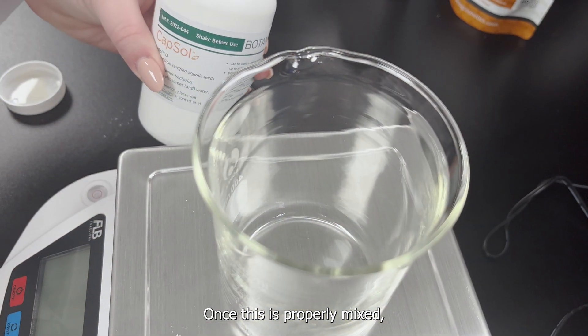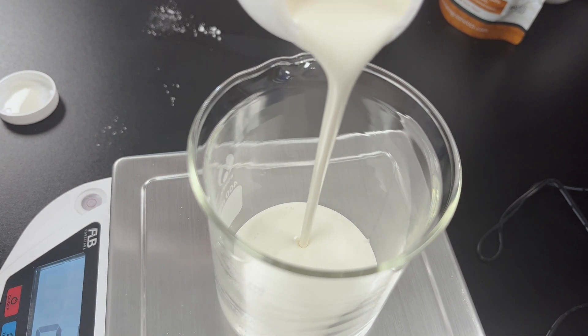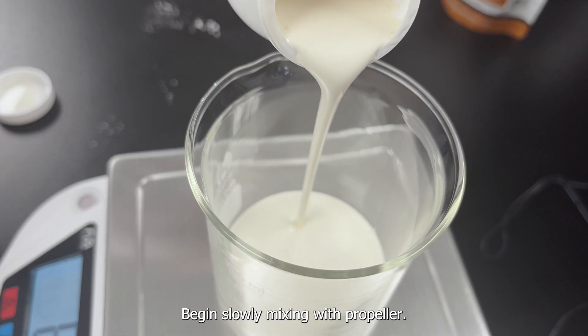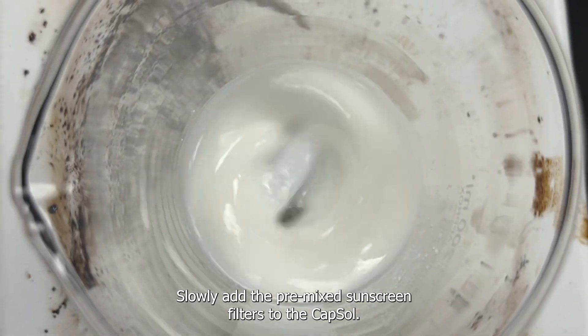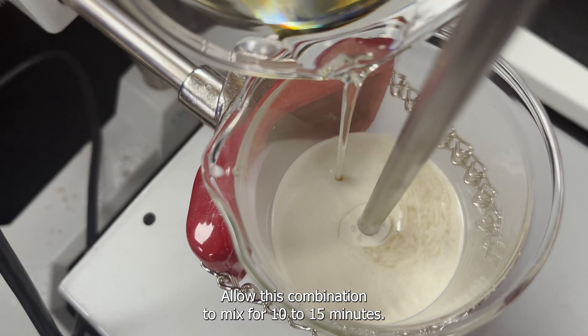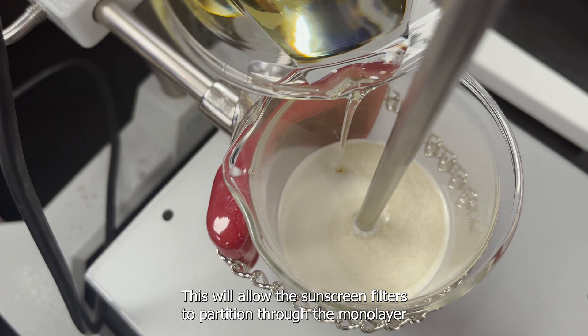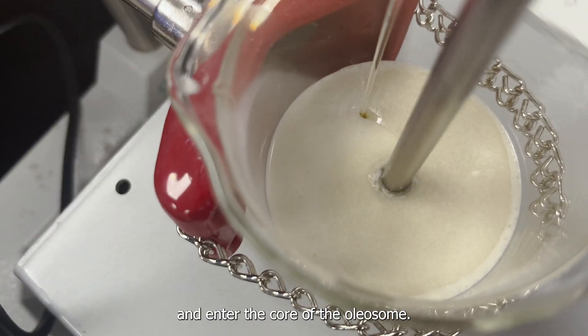Once this is properly mixed, we can then add the capsule to a separate beaker. Begin slowly mixing with propeller. Slowly add the premix sunscreen filters to the capsule. Allow this combination to mix for 10 to 15 minutes. This will allow the sunscreen filters to partition through the monolayer and enter the core of the oleosome.